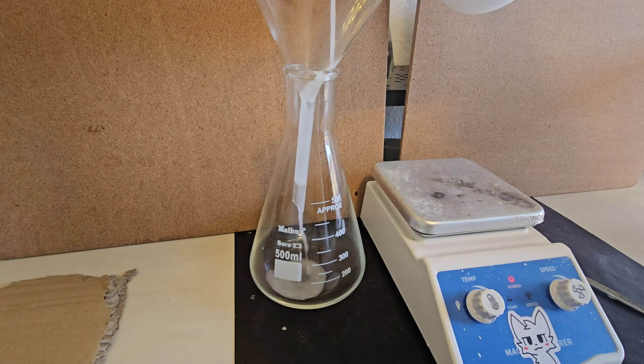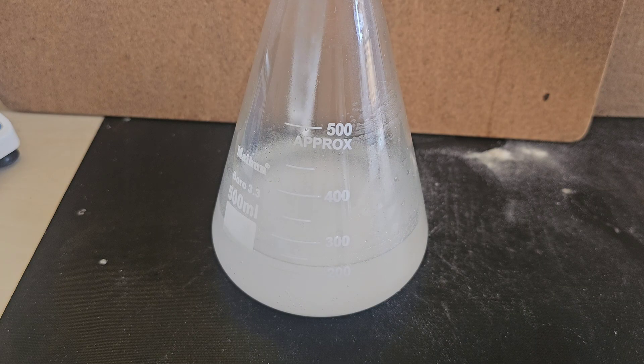Now what we are going to do is pour it carefully into another container — I am using a flask — and add some more vinegar to dissolve any remaining baking soda particles floating around. Be sure to also add this slowly to avoid it bubbling over and making a huge mess.